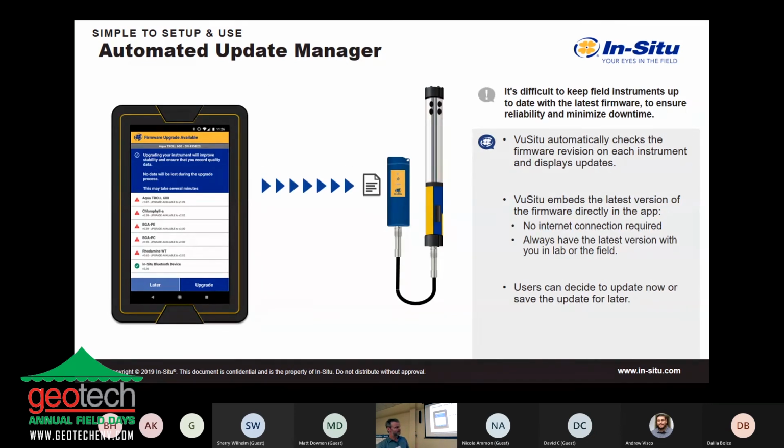And all of your firmware updates. So when you download our update of our app onto your phone or your tablet or your computer, you go out and hook into our gear. It's going to let you know, hey, we've got some updates to do. Depending on how big the update is, how many updates you might have skipped, will depend on how long it takes for you out in the field to do this update. But it is usually pretty painless and pretty quick.